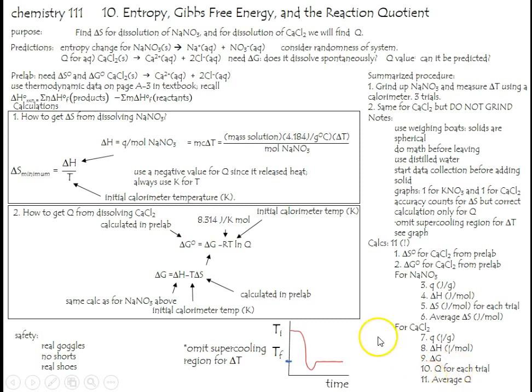In terms of safety for this lab, like all labs, be sure to use real goggles, not just the glasses kind. No shorts, please. Real shoes, even though it's starting to get warm. And this is experiment number 10, entropy, Gibbs free energy, and the reaction quotient.